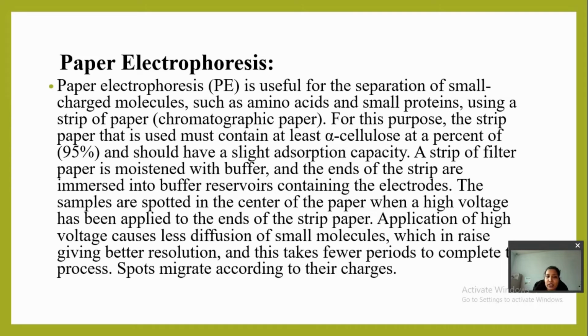A high voltage is applied to the ends of the strip of paper. Application of high voltage causes less diffusion of small molecules, which gives better resolution, and it takes less time to complete the process. Spots migrate according to their charges.